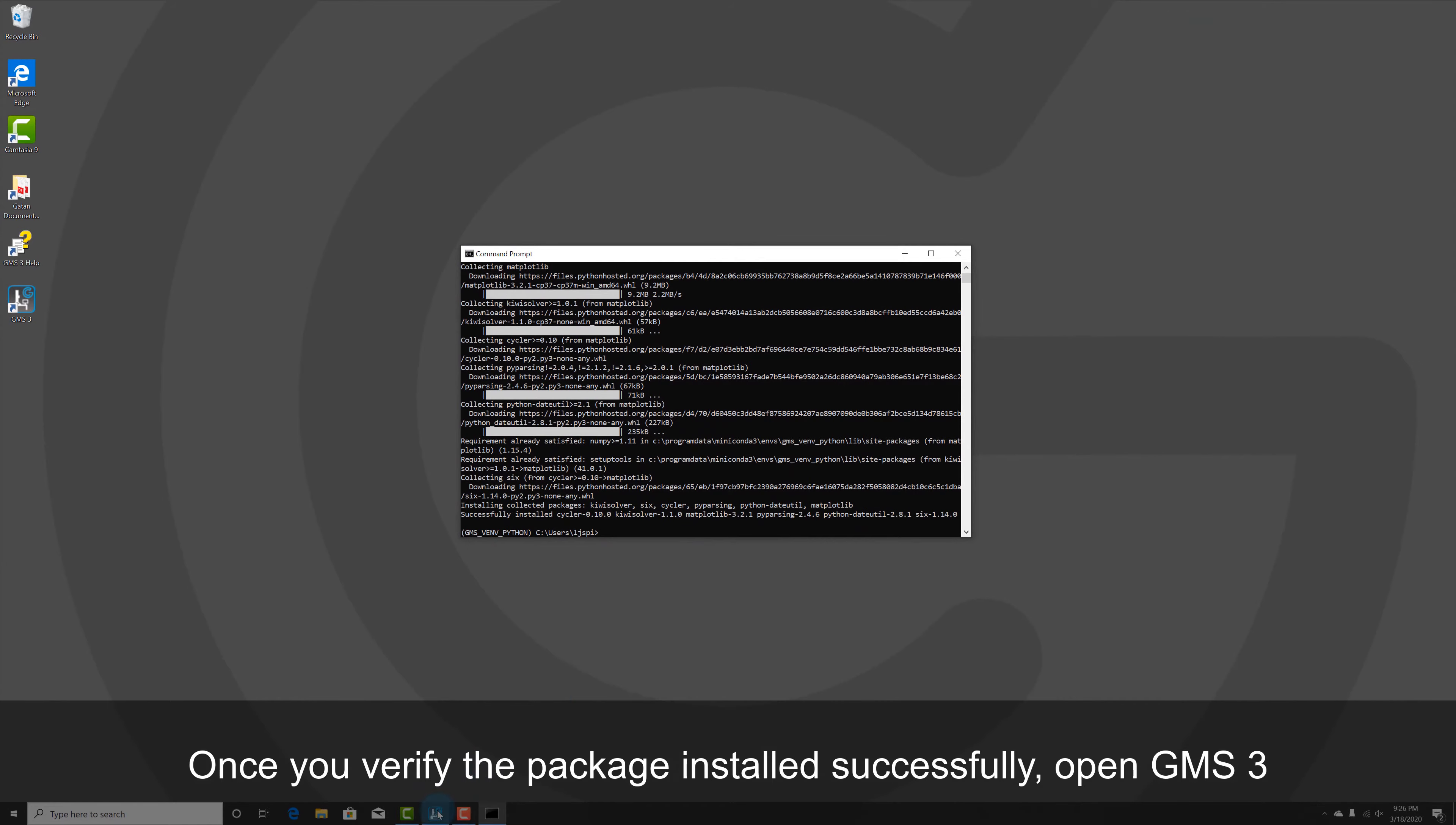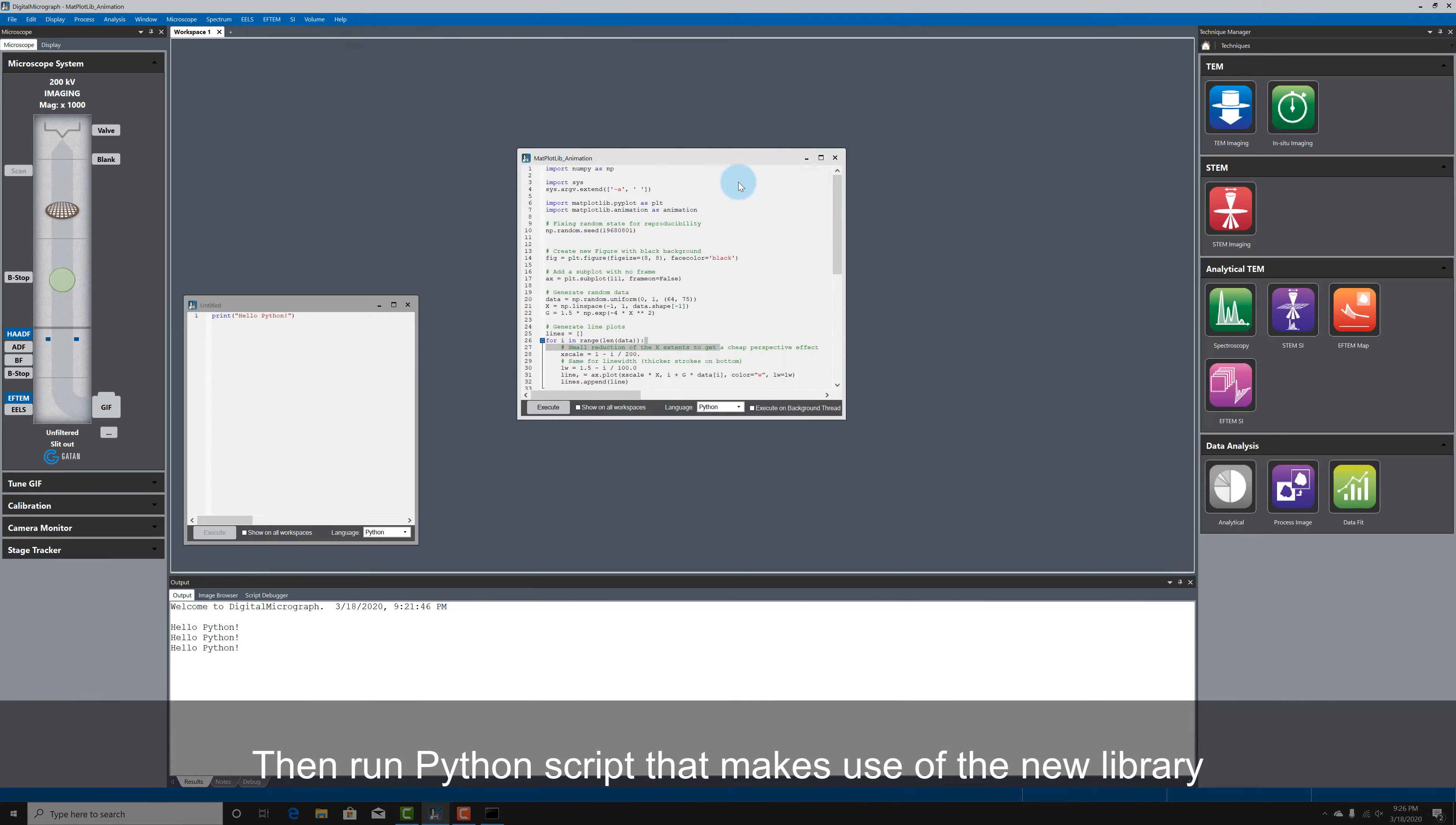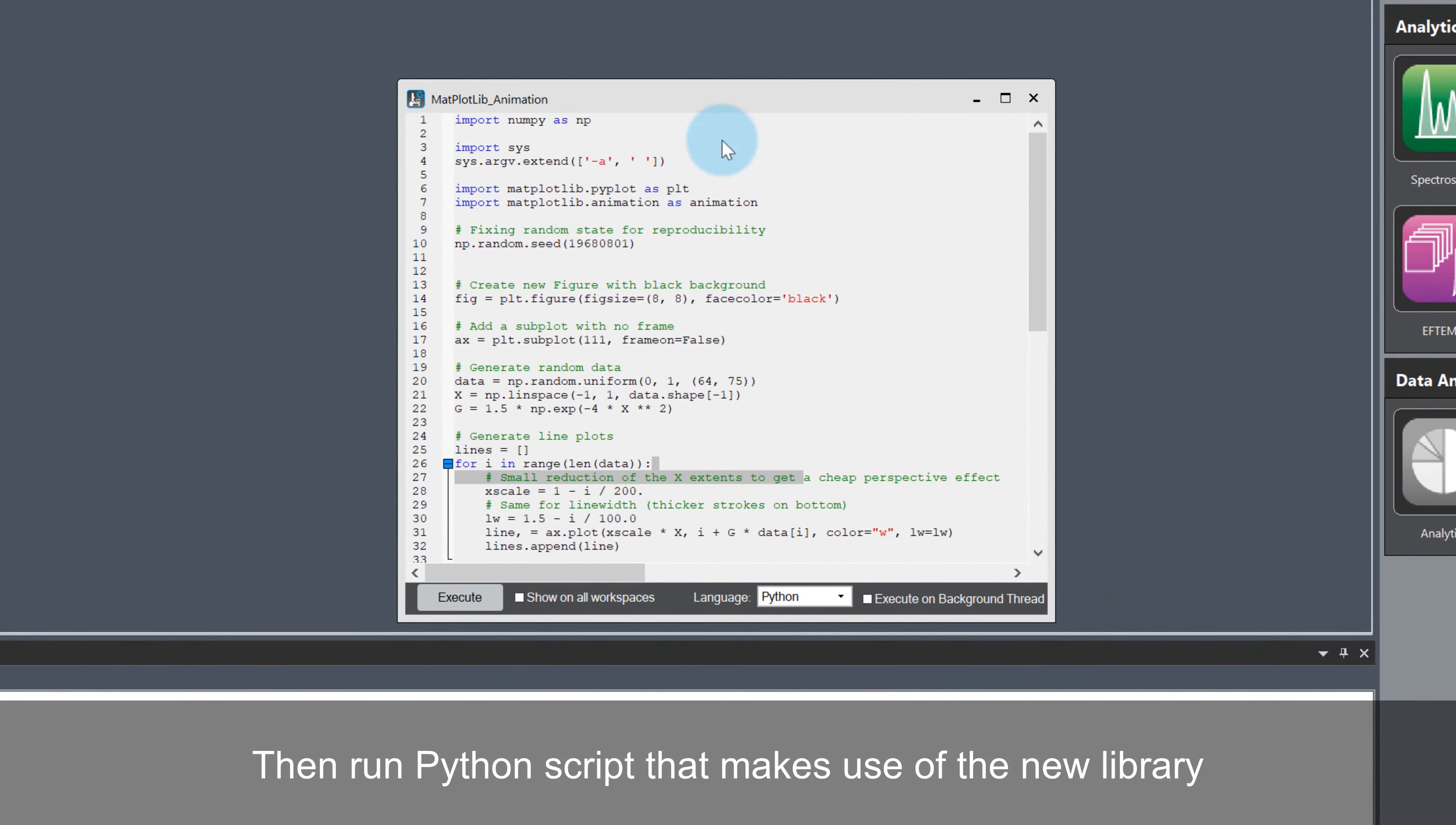Once I have verified matplotlib has installed successfully, I can just go back to GMS and run Python code that makes use of the new library.